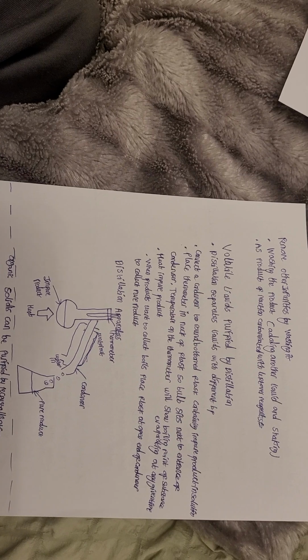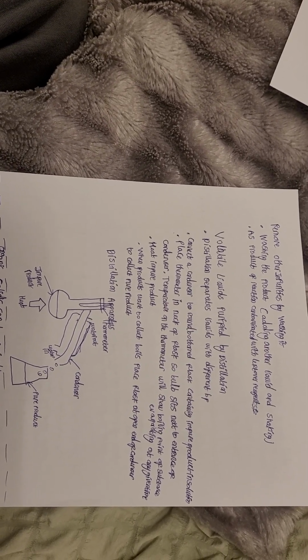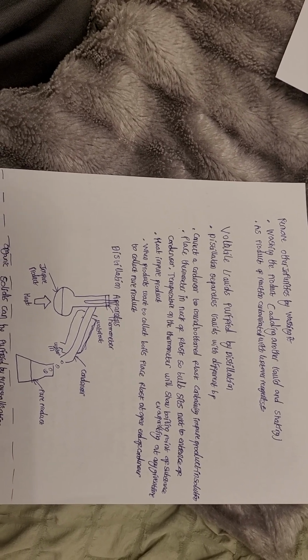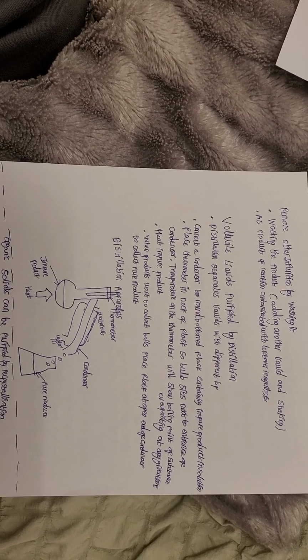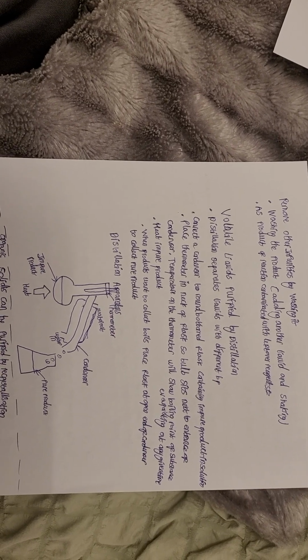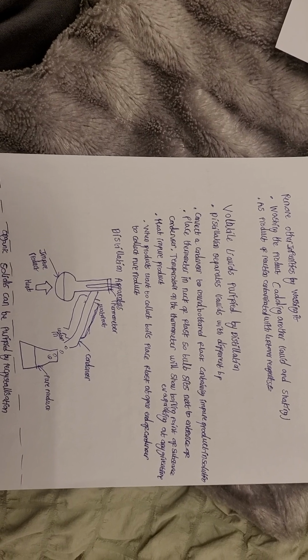Volatile liquids can be purified by distillation. Well, what does distillation do? It separates liquids with different boiling points. So, we connect a condenser to a round bottom flask containing the impure product in solution, then we place the thermometer in the neck of the flask so the bulb sits next to the entrance of the condenser. The temperature on the thermometer will show the boiling point.